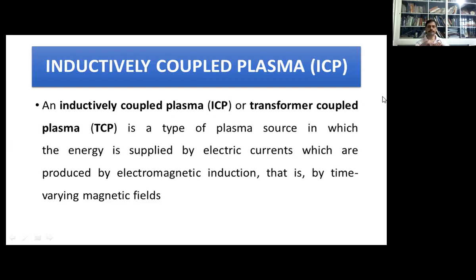In all the instrumental methods of analysis, we have a source of energy, which may be in the form of electrons, protons, light, that is cathodoluminescence, or it may be in the form of X-rays, gamma rays, etc. This energy beam interacts with the particles of the sample and the signals are generated. These various types of signals are captured, they are transduced, they are amplified, they are presented and analyzed.